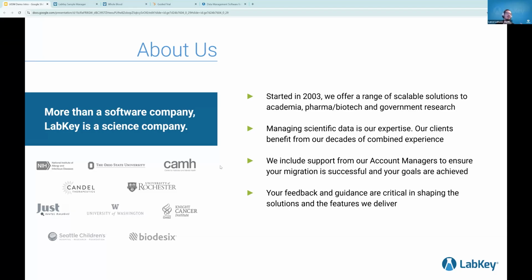So LabKey started over 20 years ago with part of the Fred Hutch Cancer Research Center here in Seattle, Washington. And since then, we've grown and we've partnered with a bunch of different organizations and a bunch of different labs to really manage their scientific data. So with all of our clients, we partner with them, make sure that they have all the customer support that they need. We help to configure and onboard and implement their new software.